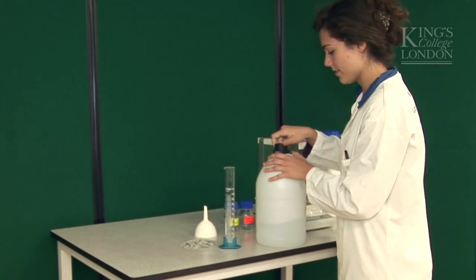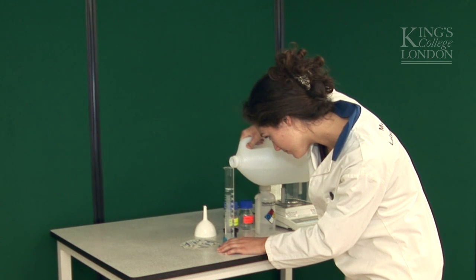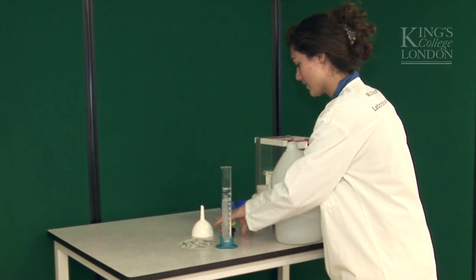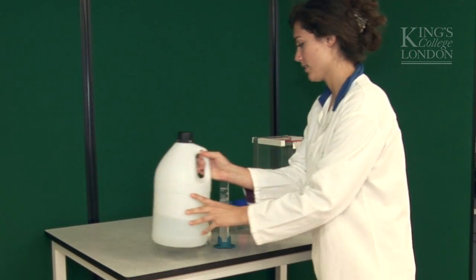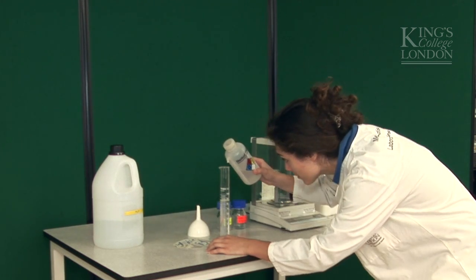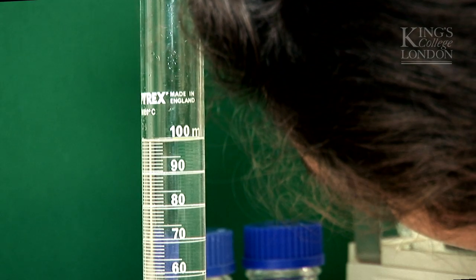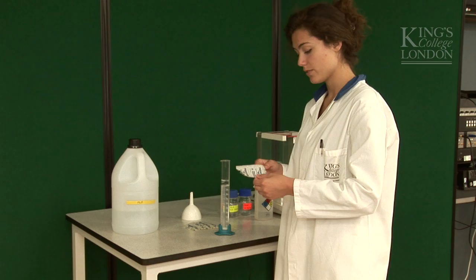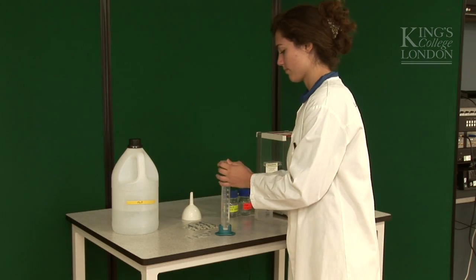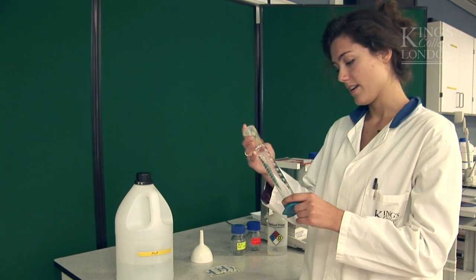Now add distilled water to make our 100 milliliters. Because I need to be precise, I'm going to get the meniscus touching the 100 milliliters line, and I'm going to use this bottle to get it right. Now I'm going to stretch some parafilm over the top and give it a good mix. Okay, I think I've mixed it enough. The sodium chloride is fully dissolved.